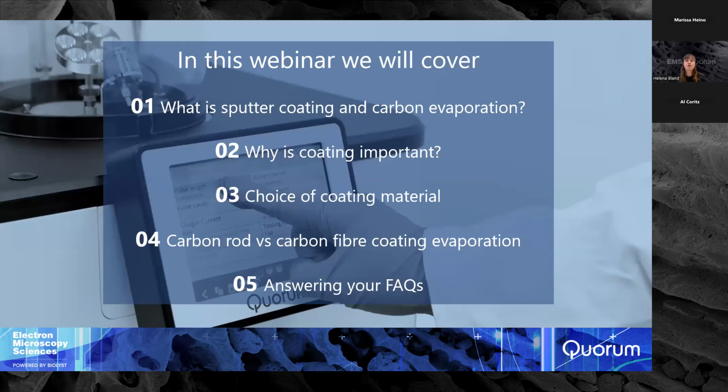Just to give you an overview of what we're going to cover in this webinar, I'm going to start off by talking about what sputter coating is and the theory behind sputter coating and carbon evaporation, and then moving on to why it's so important in our sample preparation process. We're then going to be focusing on how we go about choosing our coating material, depending on what we want to see from our sample. And then also going into depth about the difference between carbon rod and carbon fiber evaporation. Finally, I'm going to be covering some frequently asked questions that we get at Quorum and EMS, and then opening up the floor to take any questions from the audience.